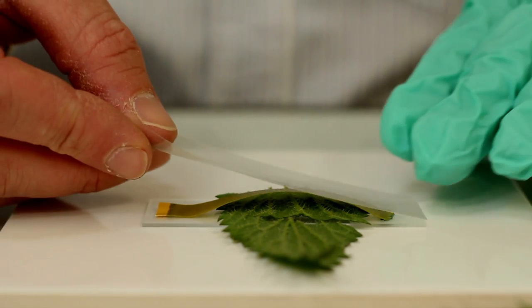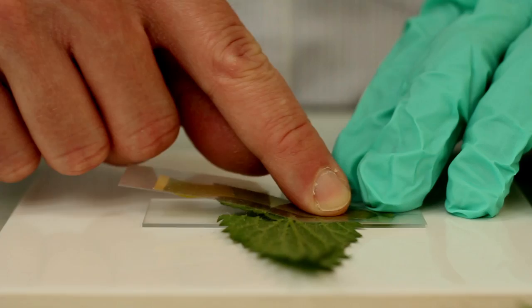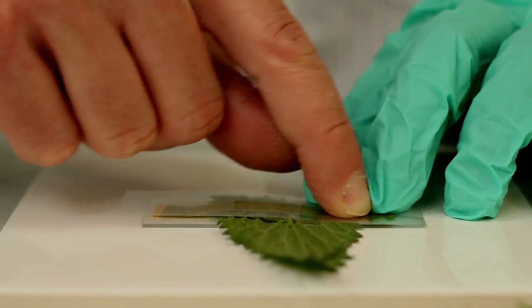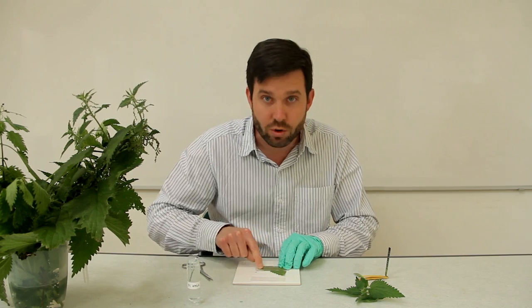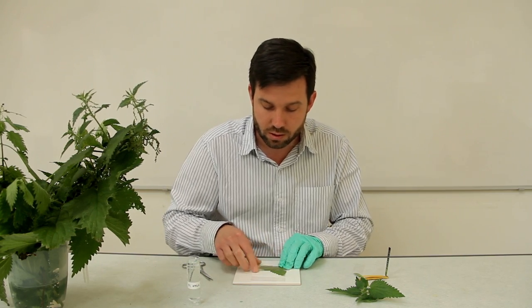Using a piece of acetate OHP material, just cut to the size of your slide, you're going to press that over the slide, pressing down on that universal indicator paper, and as you do that you'll be breaking those fragile stings.